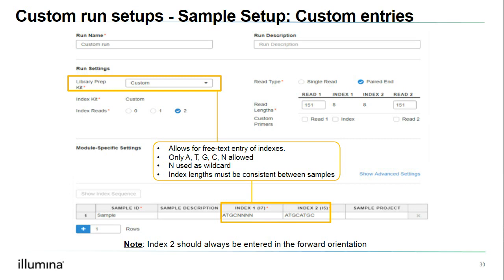It's not compatible with our high throughput instruments, such as the HiSeqs or the NovaSeqs or the NextSeq 2000. But if you are using the off-instrument version, always enter in your index 2 in the forward orientation or the MiSeq orientation. The software will recognize the data type depending on the run files and automatically reverse complement the i5 sequence if necessary.